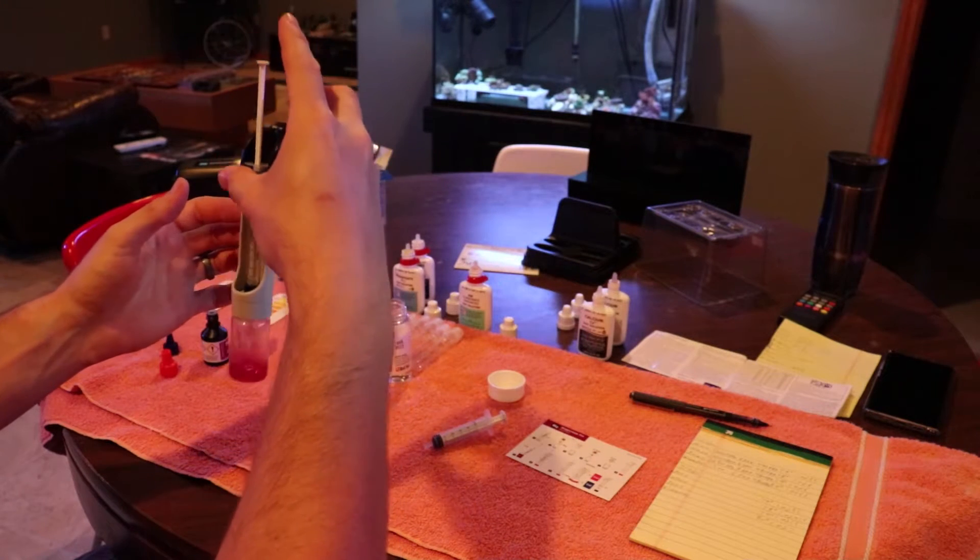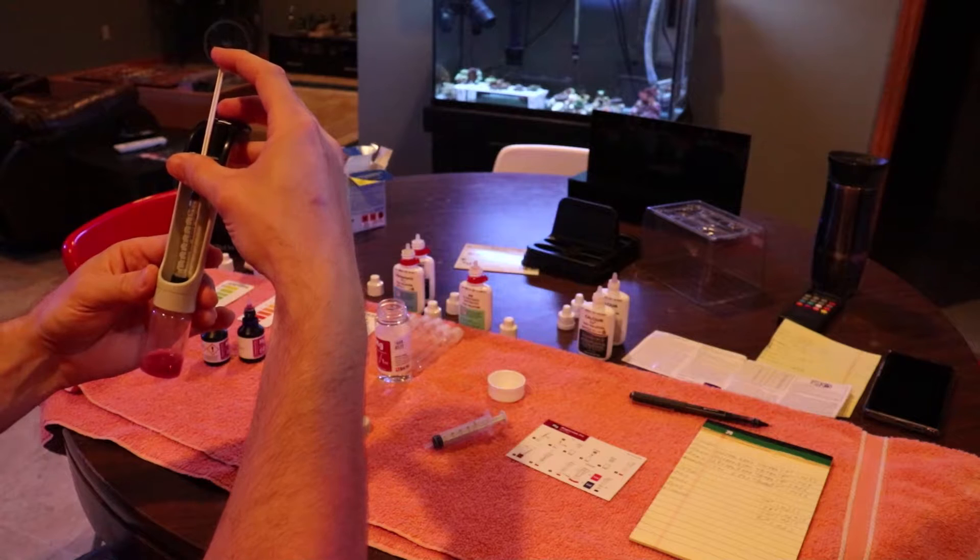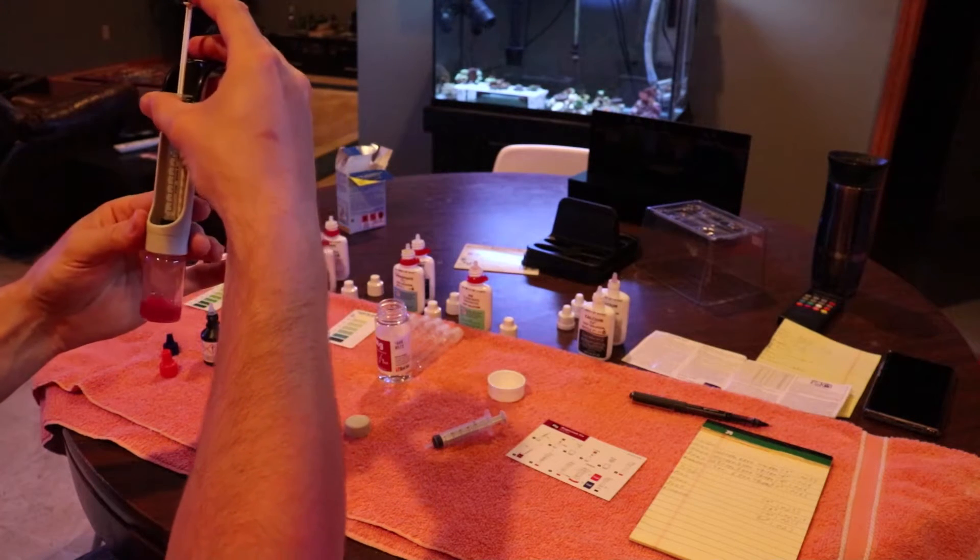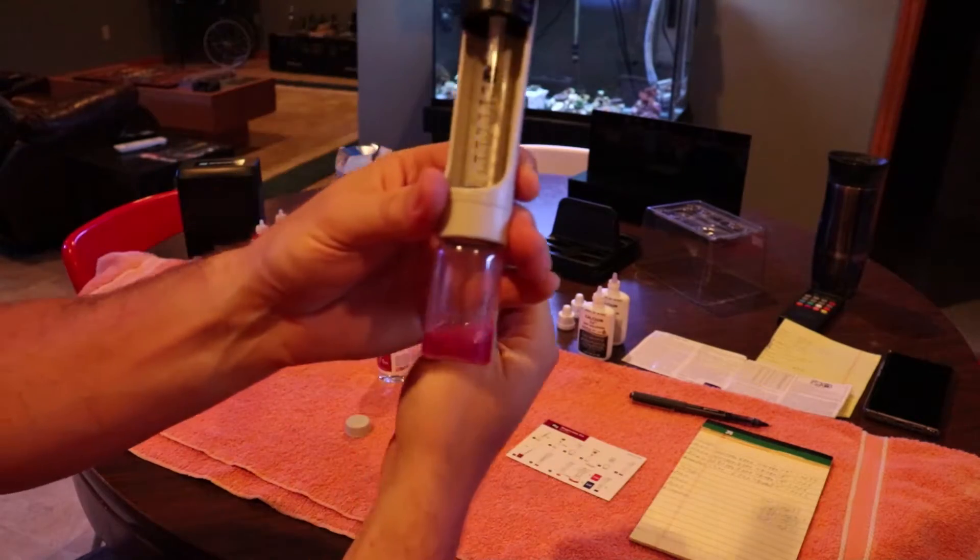It's important that the one milliliter syringe is pretty sensitive, so you want to add one drop at a time. Give it a little shake and add another drop. You can see the liquid in the jar right now is a pink color. The test is over when that solution turns to a dark purple color.